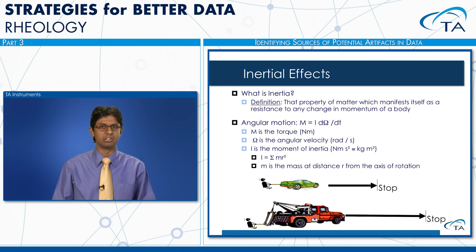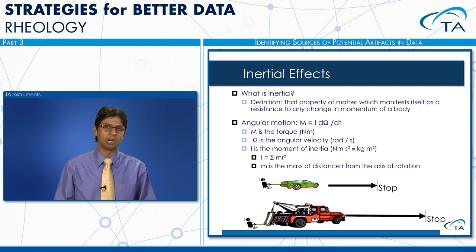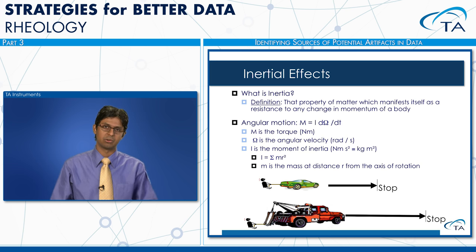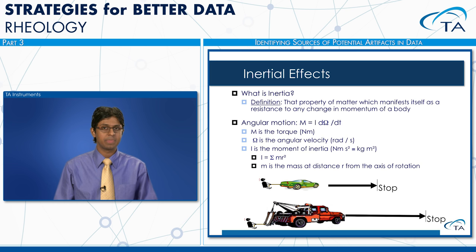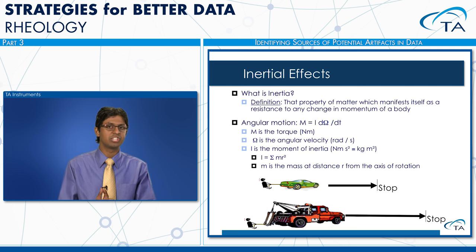The first artifact we're going to look at is inertial effects. Inertia is defined as that property of matter which resists any change in the momentum of an object. Inertial effects are important in oscillation experiments because we're constantly accelerating the rheometer geometry and shaft back and forth when applying a sinusoidal strain. Think about comparing a small sports car and a large truck and how easy it is to change direction on the smaller sports car compared to a large heavy truck.